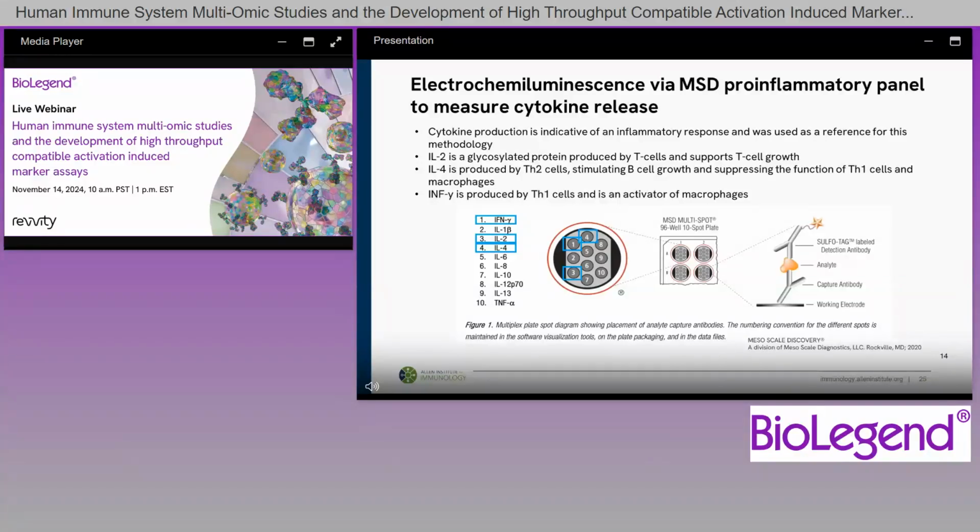Using a standard curve of known concentrations, we can measure the amount of cytokine released by the cells that went into culture. In this assay, we employ a similar set of standards to control for technical and biological variation. The standard curve controls and samples are run in duplicate to control for technical error, and automated plate washing and liquid handling are employed to ensure accurate results.